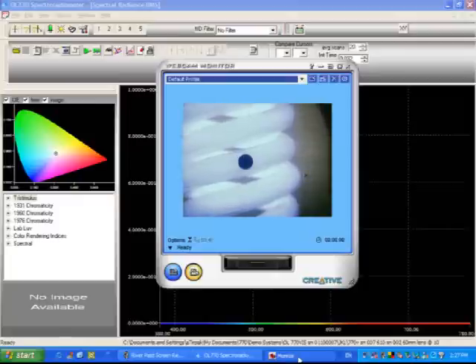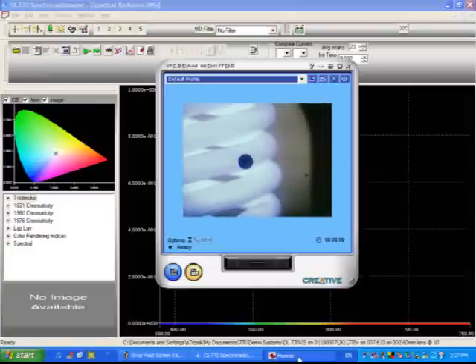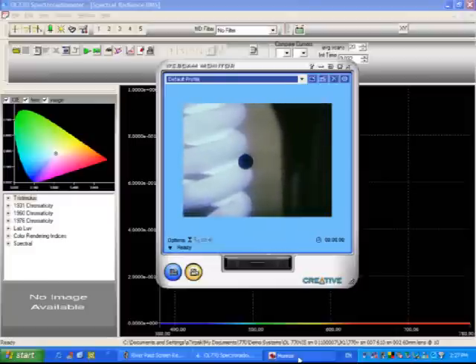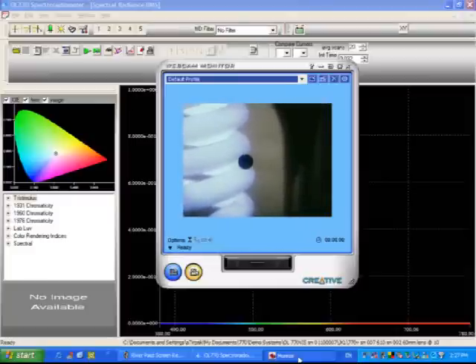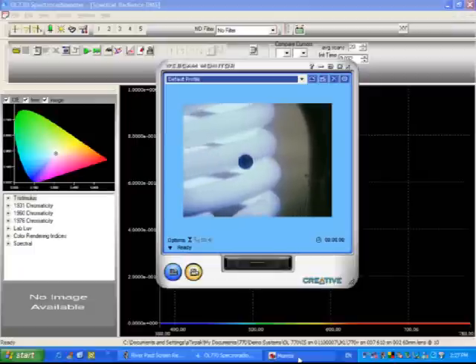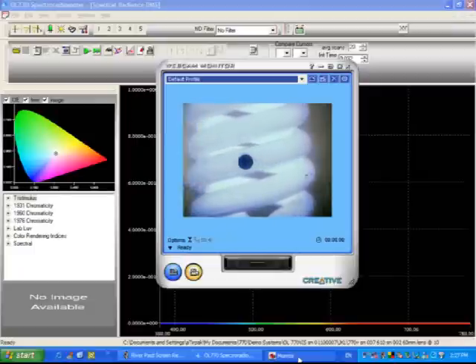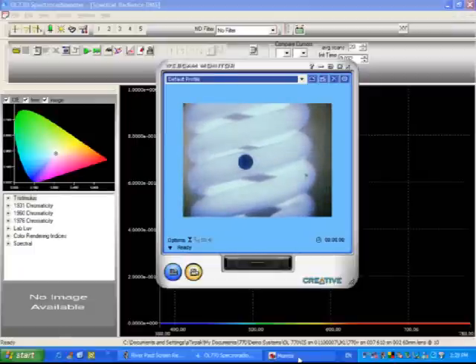In other words, you would not want to have your sample somewhere over here. Your spot would not be overfilled and you would not be getting accurate measurements. So essentially what you want to do is move your spot to where it's completely overfilled.